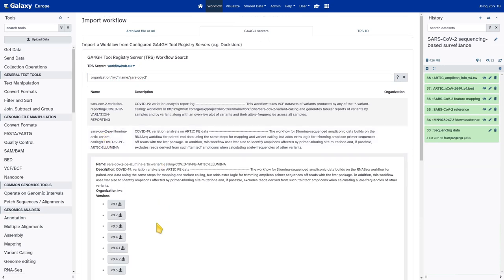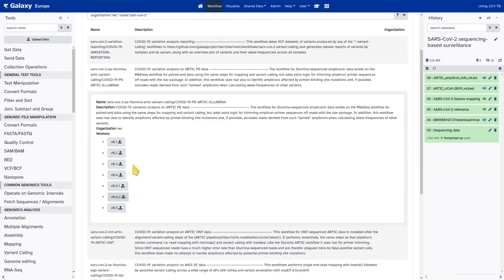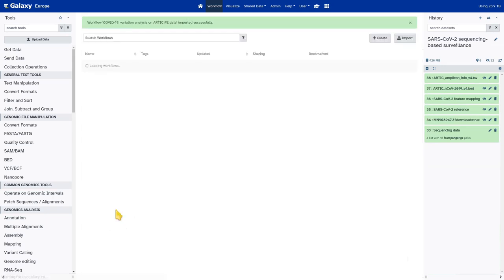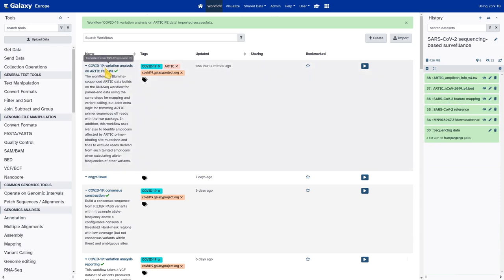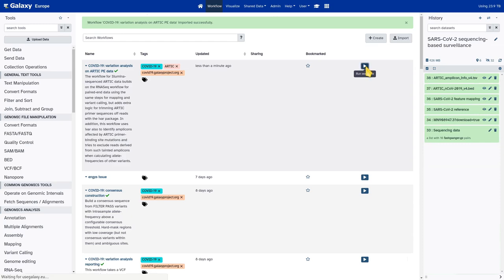Clicking on it, I have the option to select any of the published releases for this workflow available on WorkflowHub. Usually you'd want the latest version — V0.5 in this case — and clicking on it imports this workflow right into Galaxy. From there you have the option to run the workflow, and that's what we're going to do.